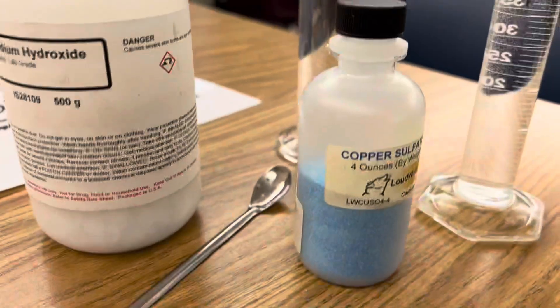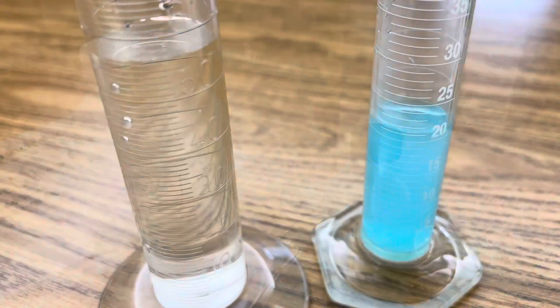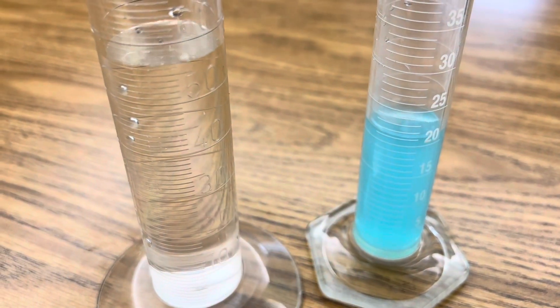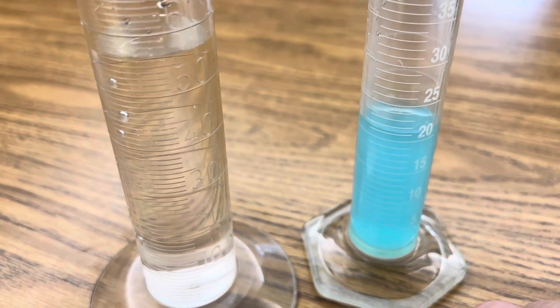All you need for this reaction is copper sulfate and sodium hydroxide and a couple of graduated cylinders with distilled water. Your first step is just to dissolve about five grams of sodium hydroxide in 60 milliliters of water in one graduated cylinder and five grams of copper sulfate in about 20 milliliters in your second graduated cylinder.